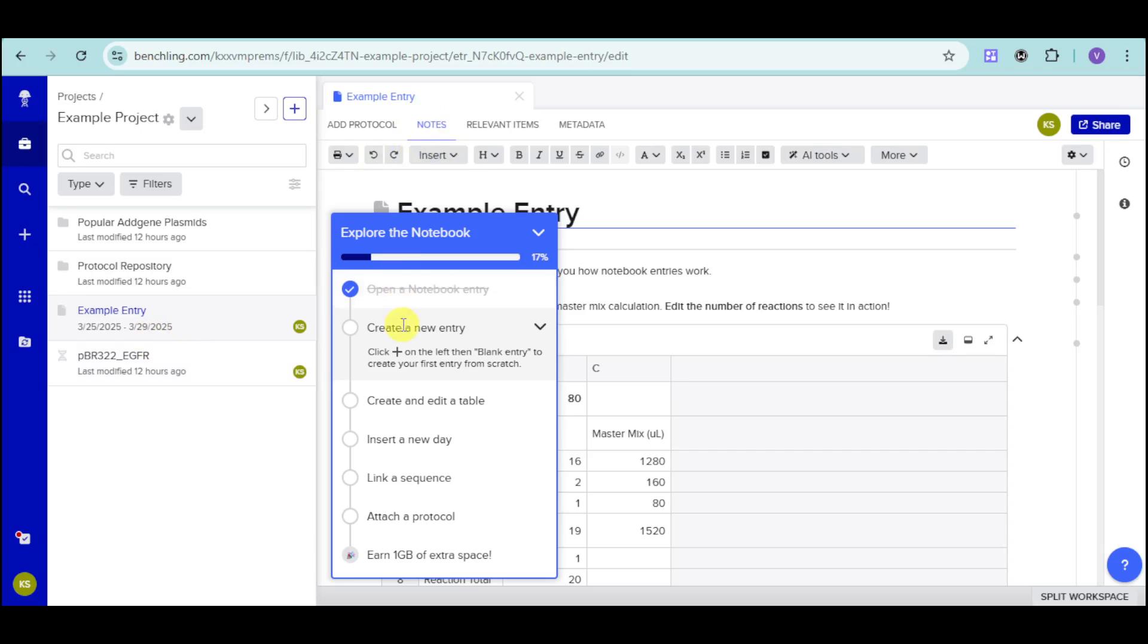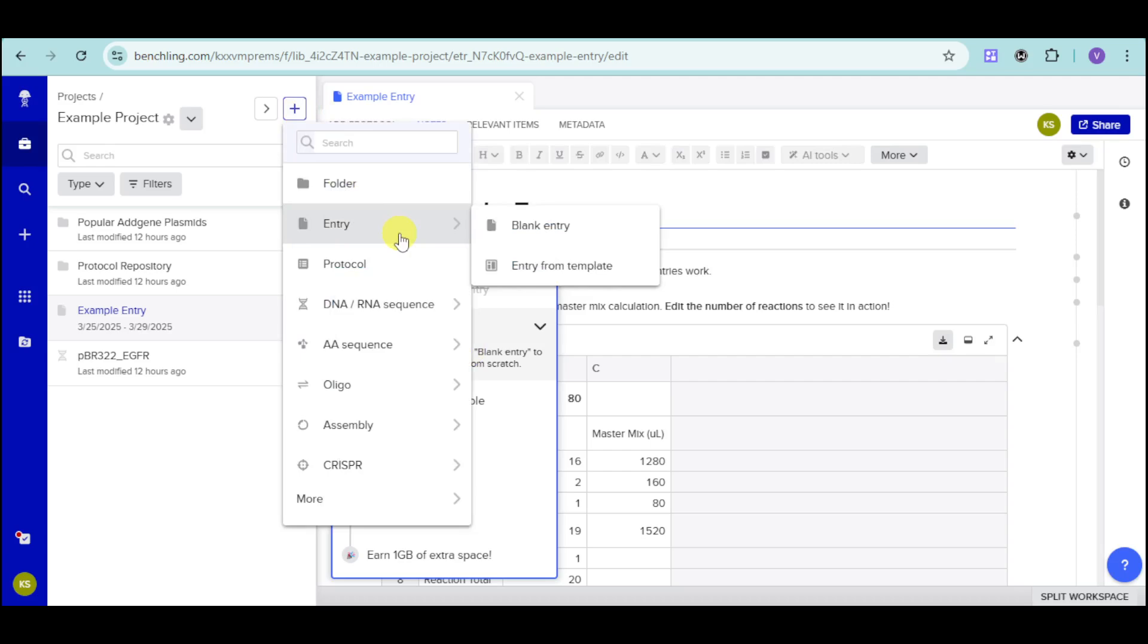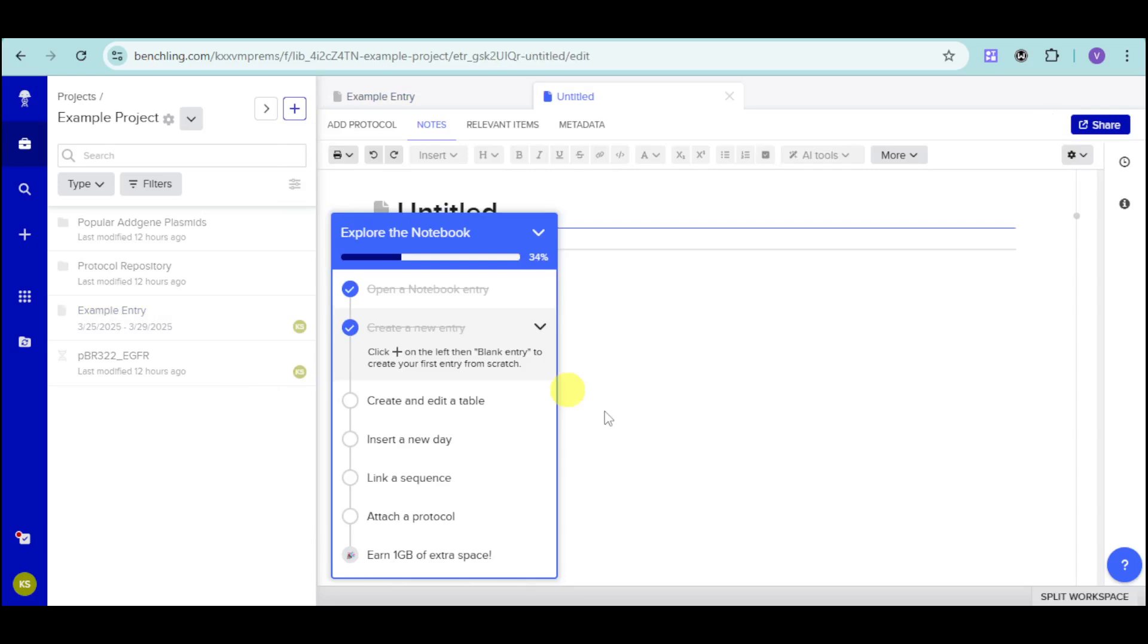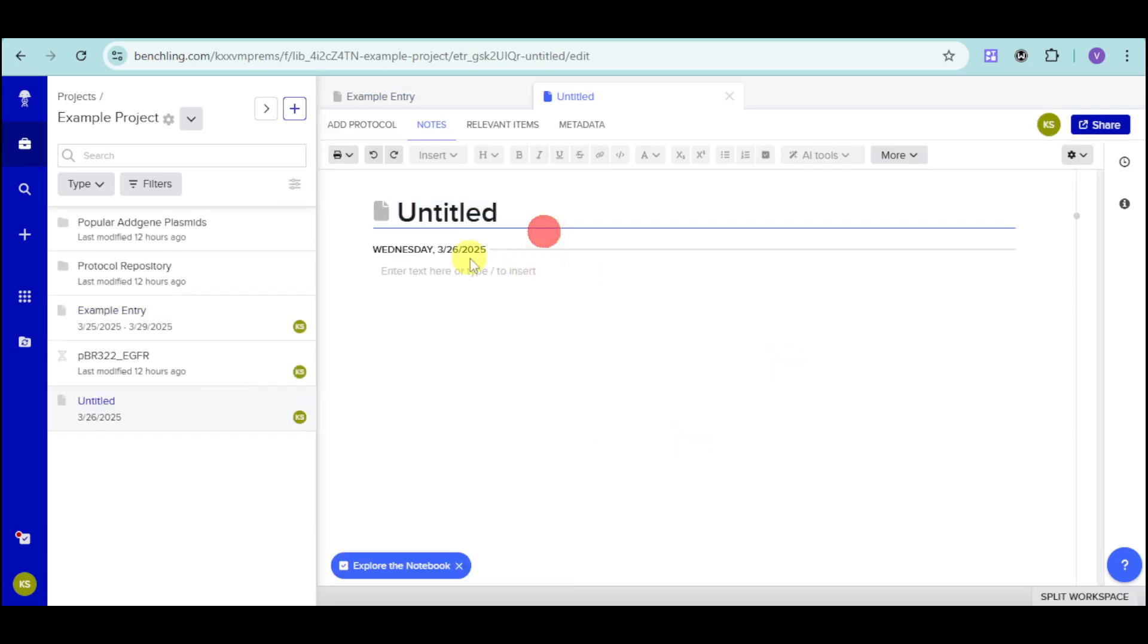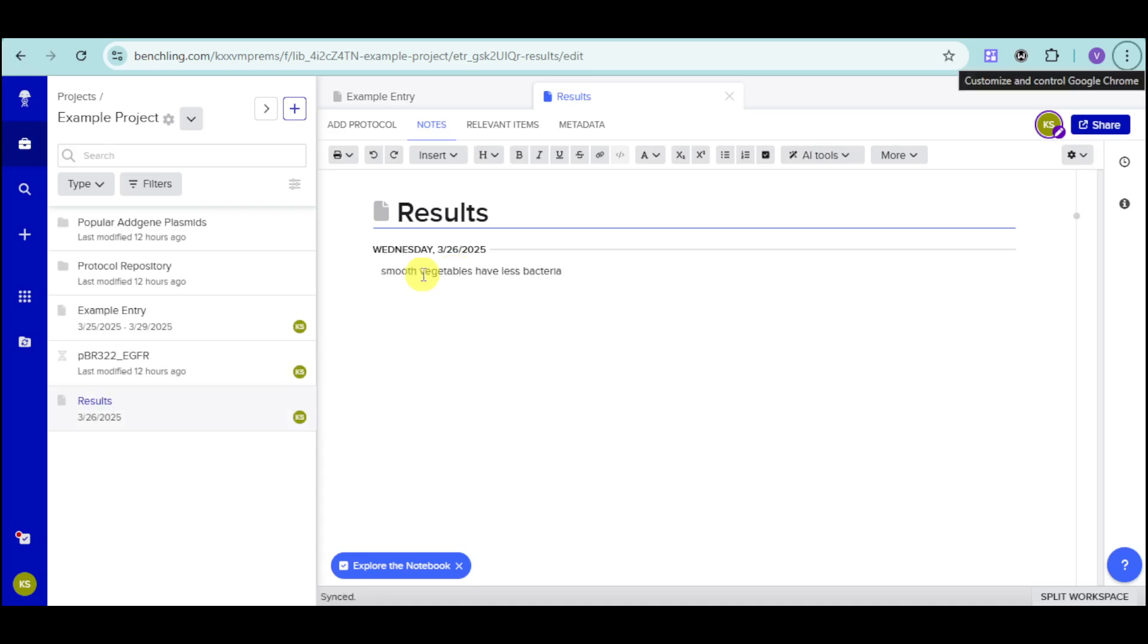You can create a new entry if you want by clicking onto this plus icon right here. Click onto this right here. Then, choose in here entry. You can choose an entry from blank or start on a template. Let's choose in here a blank entry. Then, this will load, and it will create this one. It's an untitled one. Let's name this results. And then, you can just enter in here some text that can actually describe your results.